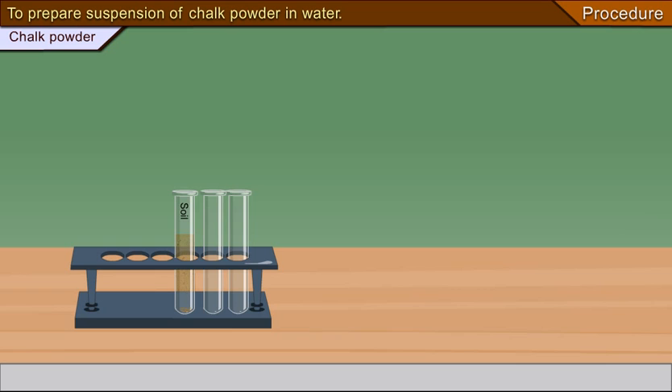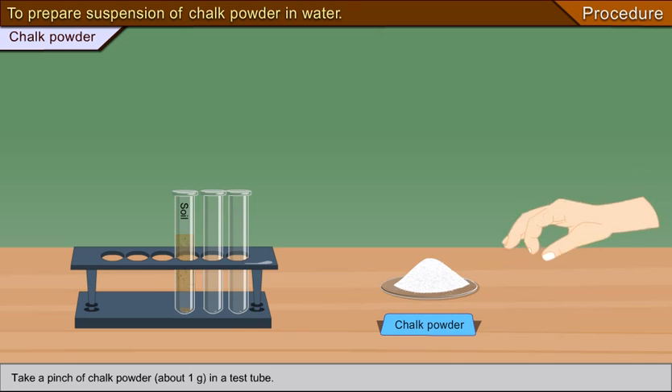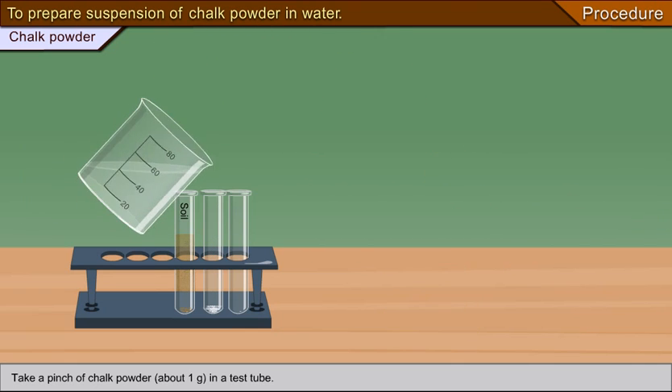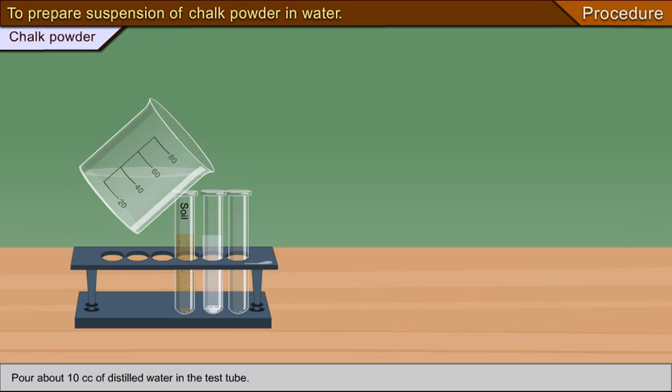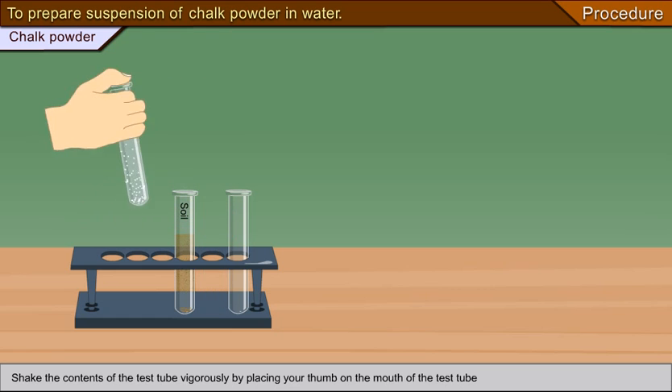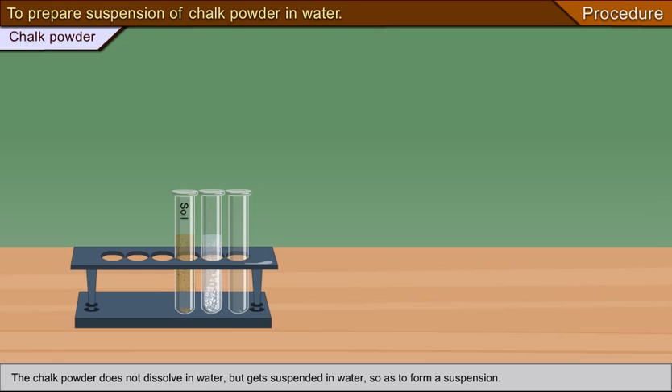To prepare a suspension of chalk powder in water, take a pinch of chalk powder (about 1 gram) in a test tube, pour about 10 cc of distilled water, and shake the contents of the test tube vigorously by placing your thumb on the mouth. The chalk powder does not dissolve in water but gets suspended in water to form a suspension.